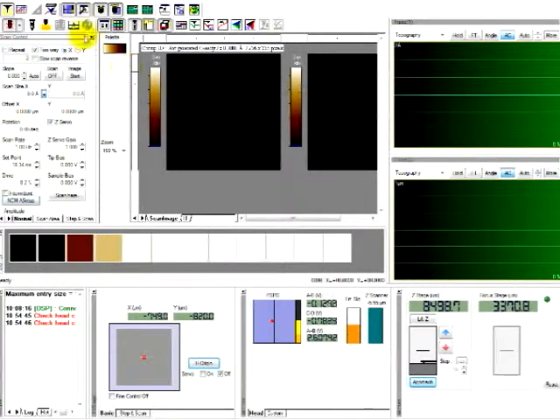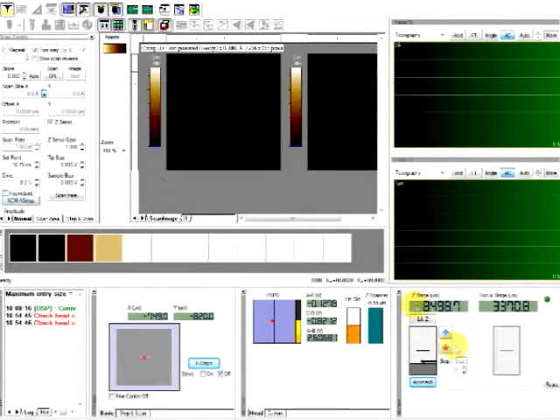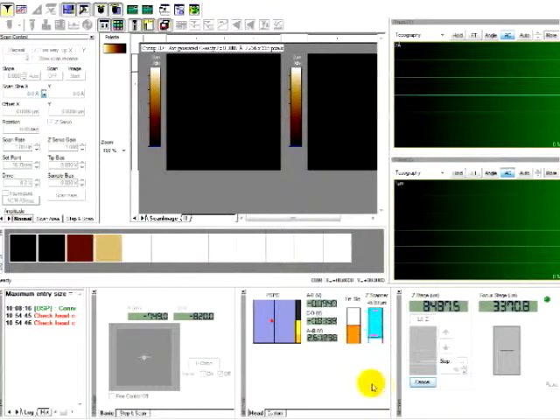Okay, and then you can click frequency sweep and setup window, and you can just refresh it over there. As you can see, set point has been reduced from 18.34 nanometers to 16.8. Then click done. Make sure the amplitude feedback is still checked. Done, and reapproach it to the sample.